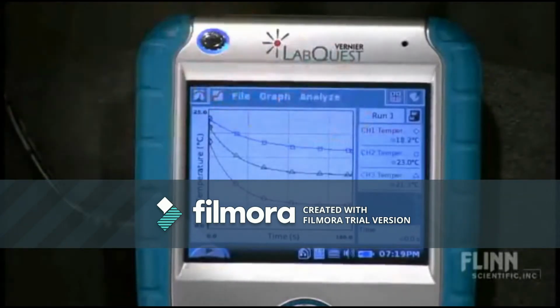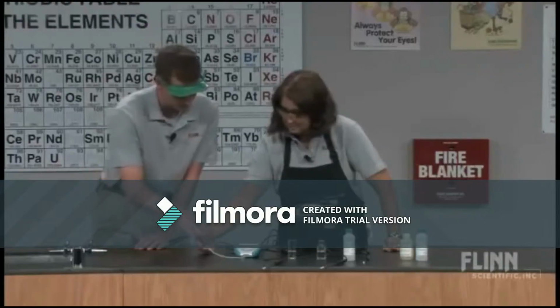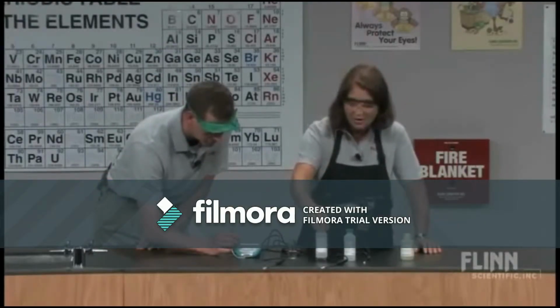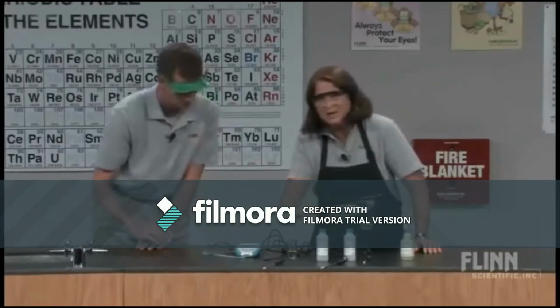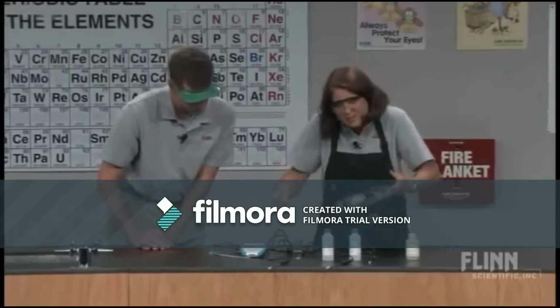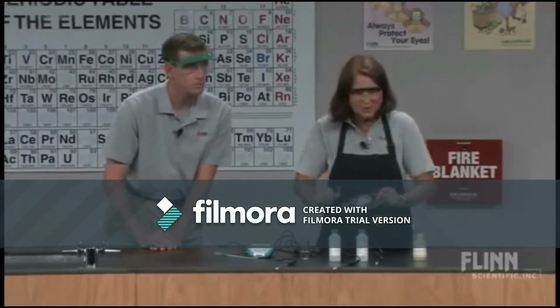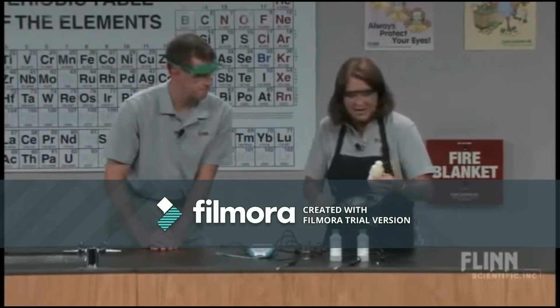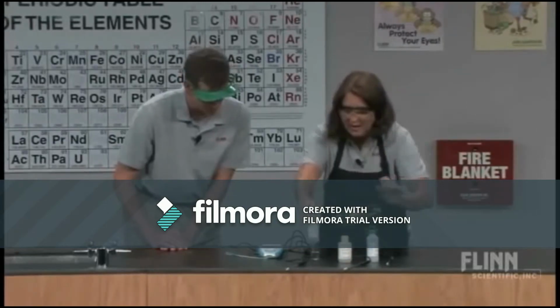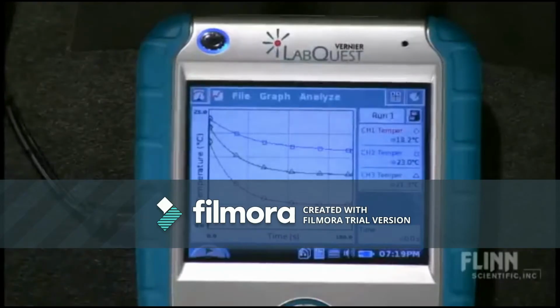That would be the blue with the squared data points. Top graph. This is our propyl alcohol. I didn't want to put them out in order. I wanted the graph to force us to match up the data that we've graphed with what we have in the vials. And then, of course, our last one, I mixed these up. This is our propyl, and this is our ethyl alcohol, which is the middle graph here.